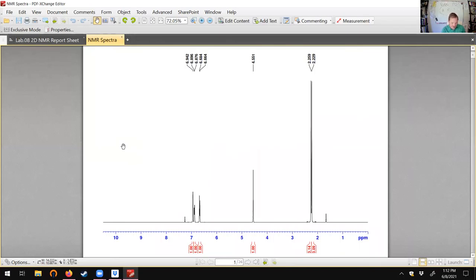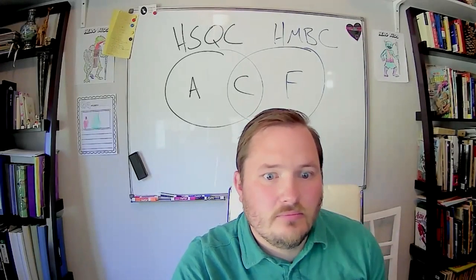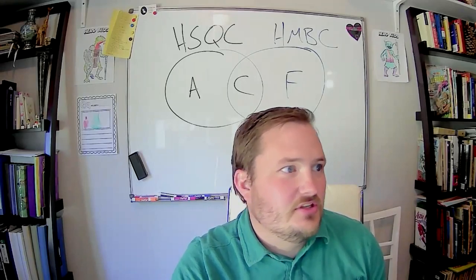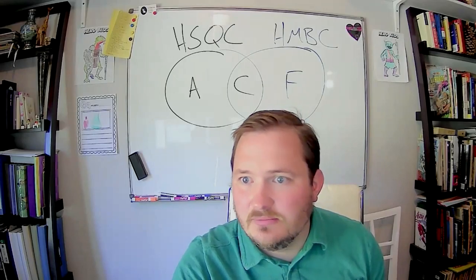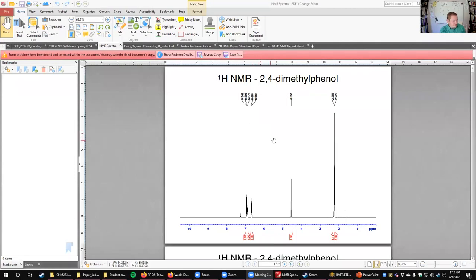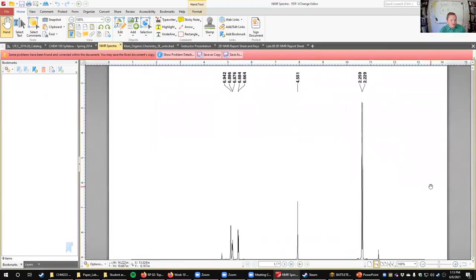when we look at the spectra for the first proton NMR, we get a variety of signals. And they're all nicely integrated for us. And just based on the integration, we're going to be able to tell something about this, right? I know how I can do this. It's not going to be a total mess. The annotations on Zoom just do not work the way I want them to. So let me think, I've got an idea.